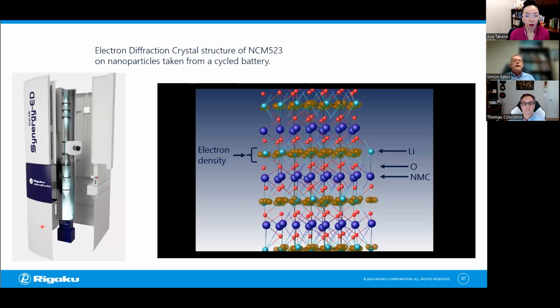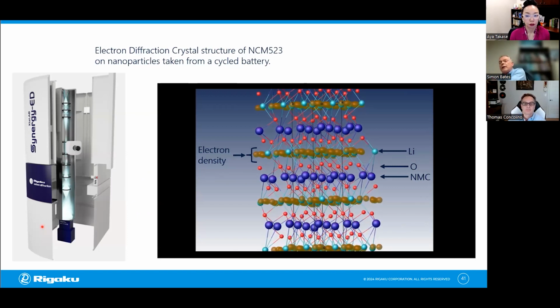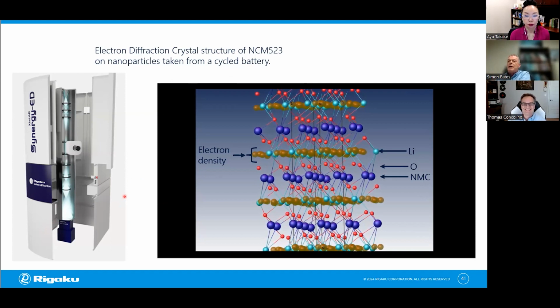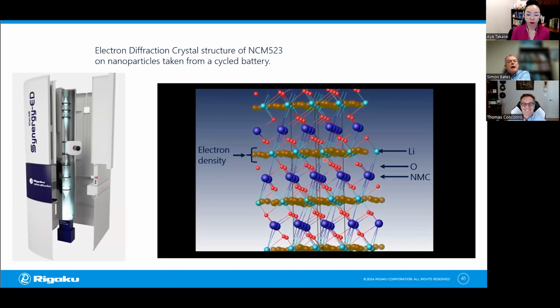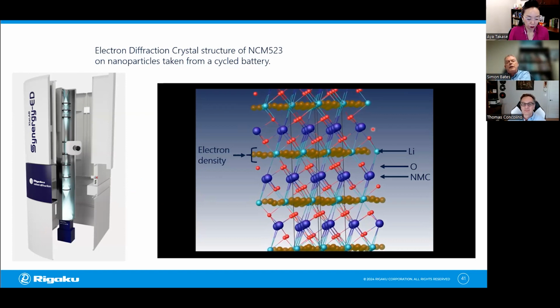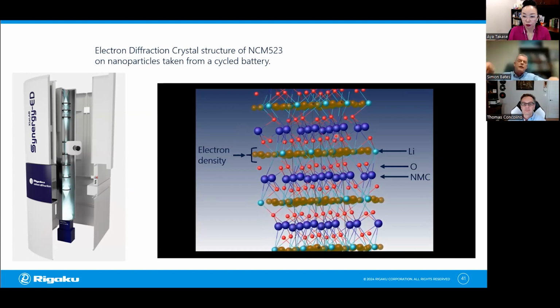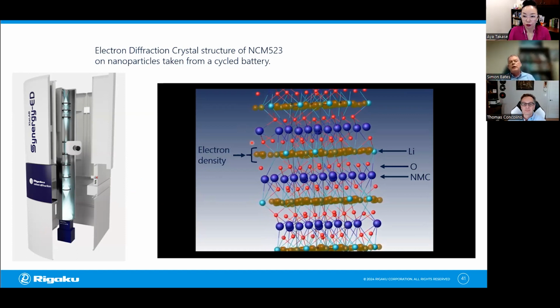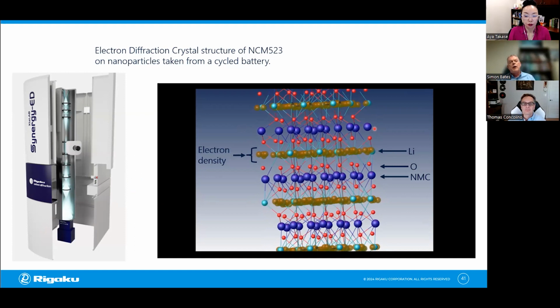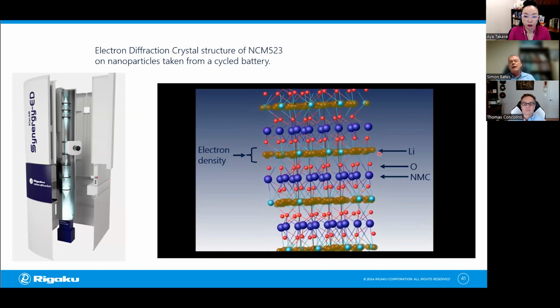And this is the crystal structure that we solved. Well, I didn't solve it. One of my colleagues, Lee, solved it in the single crystal group. And it's really fascinating. It truly is. So the metallic layers are really well defined. And now you can begin to see the hexagonal structure within those layers. Oxygen, no problems with the oxygen, pretty well behaved. But the lithium layer, oh my Lord, bad things are going on in the lithium layer.